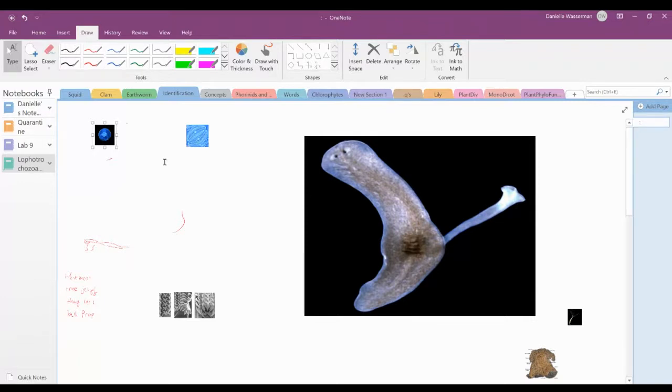Okay, so this is planaria. I'm writing planaria species. So that's the genus, and you're not going to be asked what genus this is. But you could be asked, what is this? So you can say planarian, and that's a lower level. It is also a turbellarian. Flatworm.